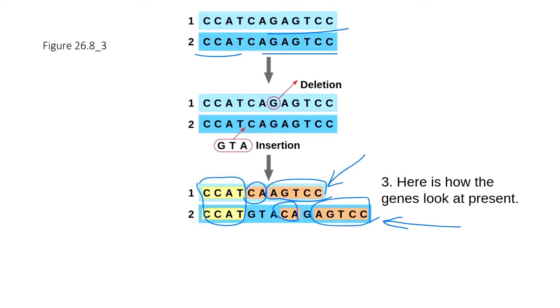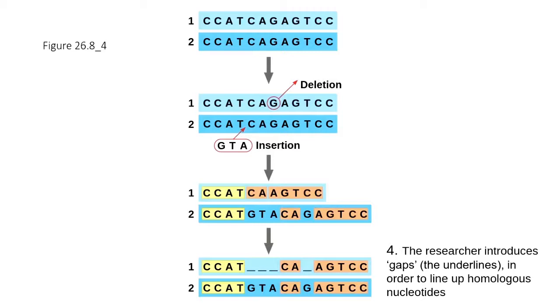So the software is going to perform this alignment. It's going to find the pieces that are labeled with the same color on this illustration. Of course, there will be no color when you feed the sequences to the software, but in MEGA, when you perform the alignment, you will see that it actually colors it for you. Instead of this insertion of GTA, the software is going to insert gaps to fill in the empty space. And it's going to insert another gap to fill in the missing guanine that was lost earlier.